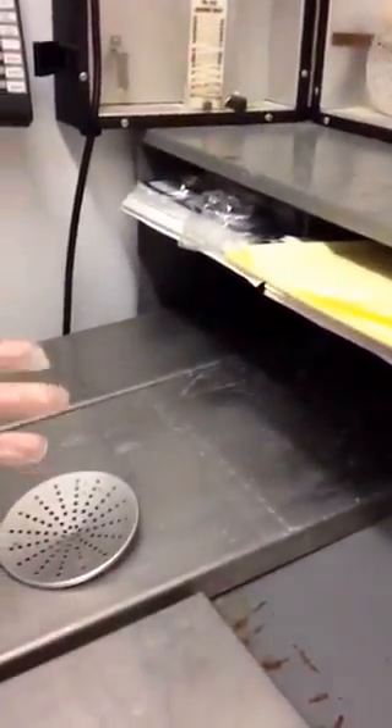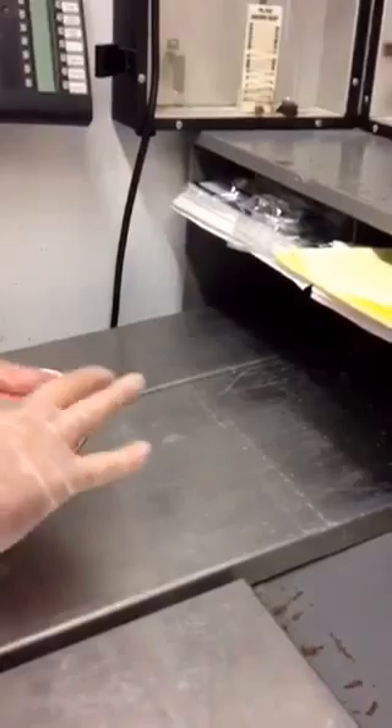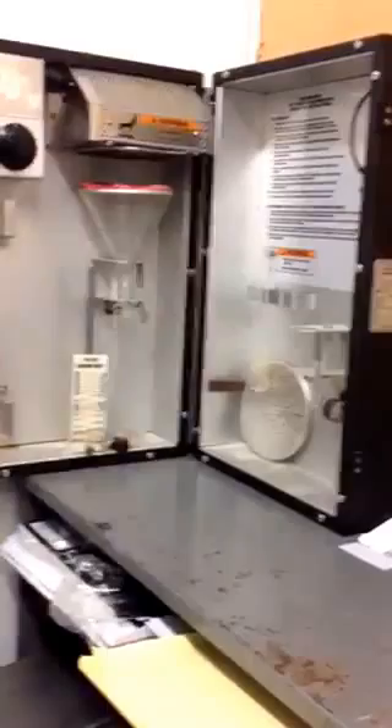We squash the burger patty down onto the plate, make a hole in the middle, and put it onto the funnel, which drips into the test tube.